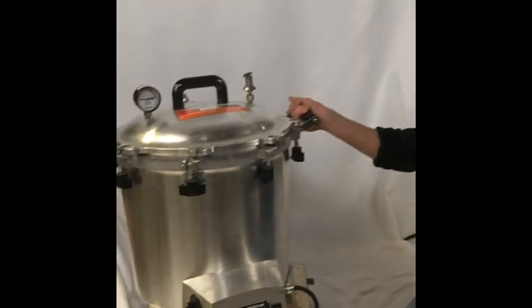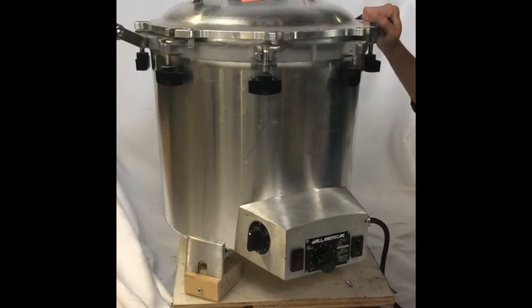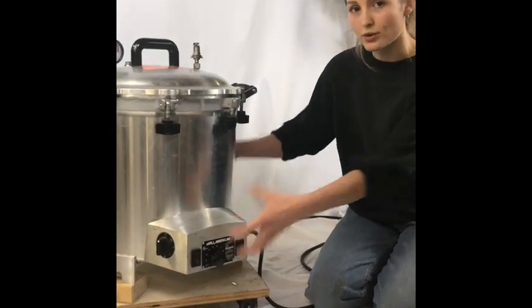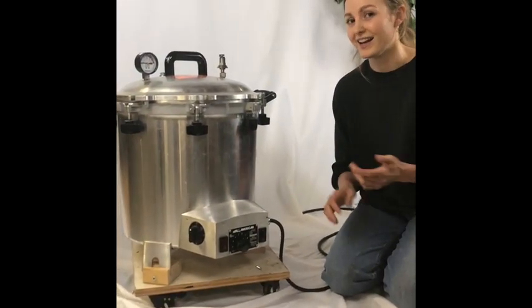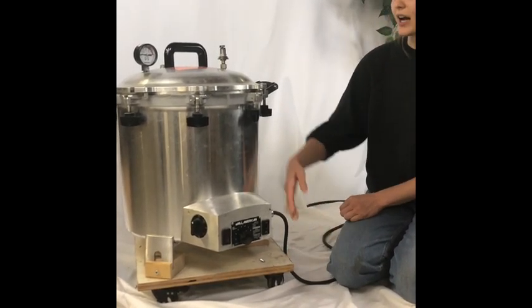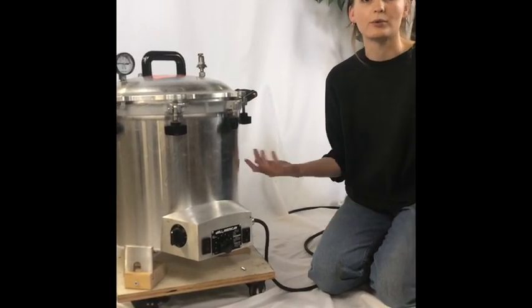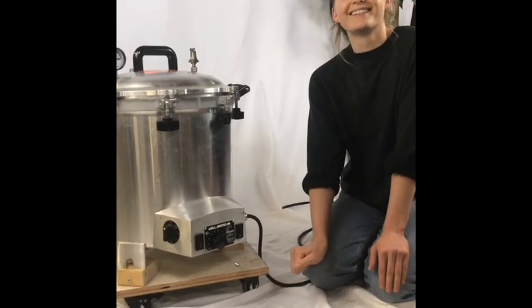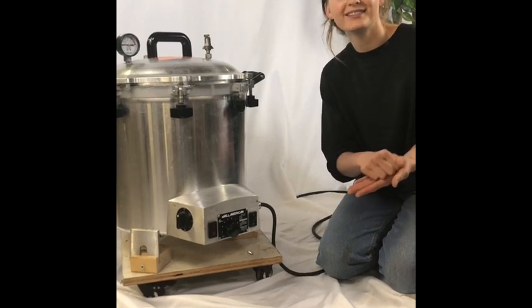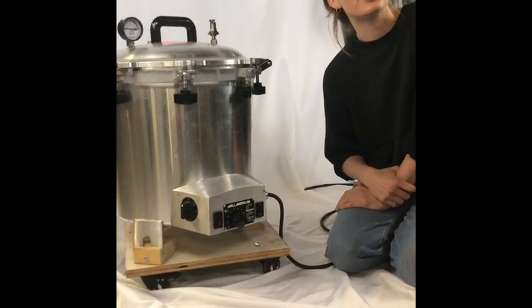Some quick notes on cleaning the machine — it's pretty easy. It cleans itself since it's sterilizing the insides. But you do have to lift up the whole thing to dump out the water, so that's yet another good reason to put it on wheels. I just wipe out the insides and outsides of whatever grime has built up with isopropyl. And stainless steel wool is great to scrub the outsides if you need to.